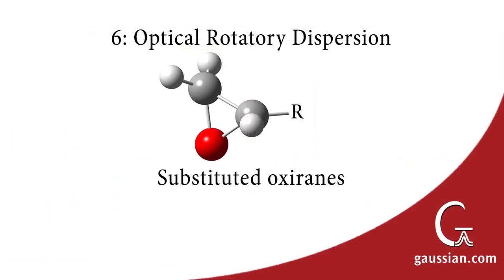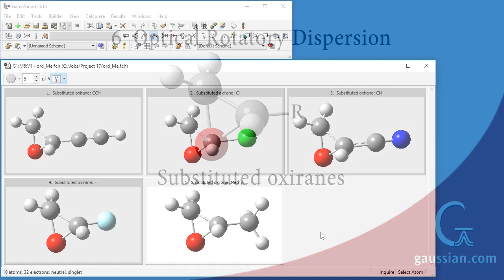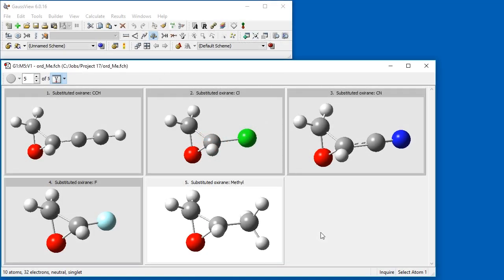GaussView can also display the results from Gaussian calculations of optical rotations, which predict the optical rotatory dispersion, ORD, at various incident light wavelengths. We will consider ORD results for a small group of substituted oxyrane compounds. We open the checkpoint file for the five optical rotation calculations into a single molecule group.